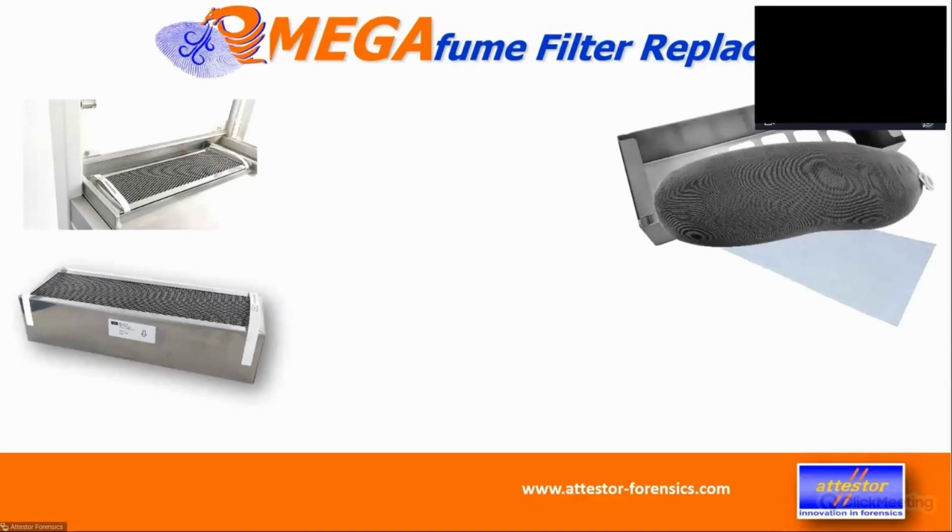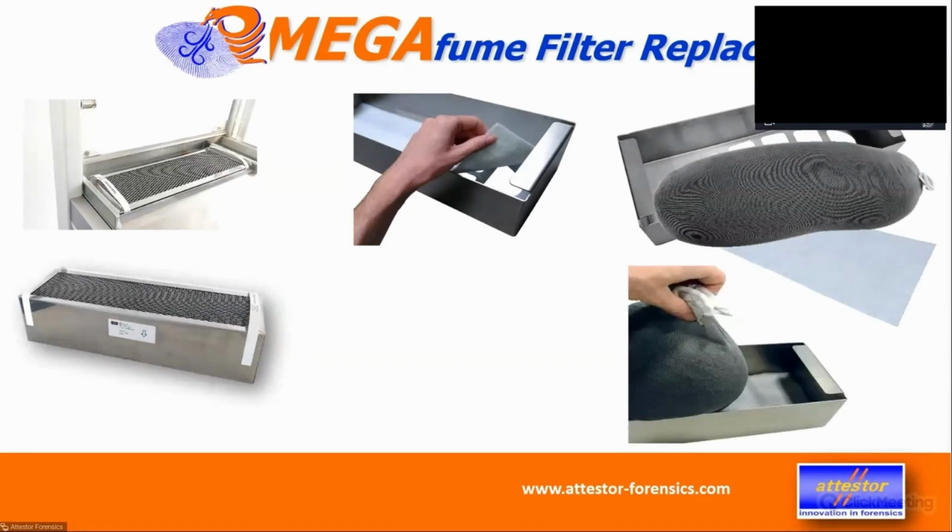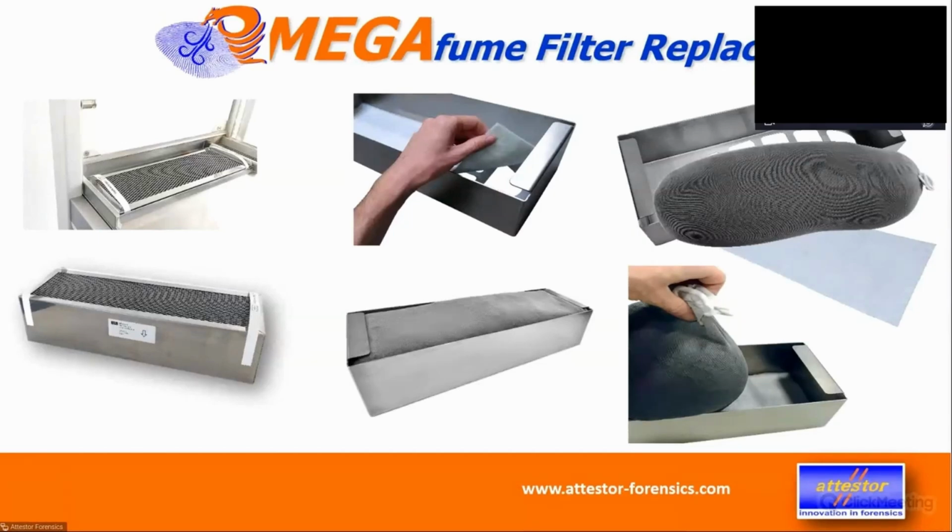Obviously, it could dust a bit, and therefore you have the dust fleece in there. And then when you have to install that, all you do is you place first your dust filter in the bottom of that cage, and then you place your sachet in there, and you have to even it a bit, and in result, that's how the replacement unit then looks like. And you place that one into that slot instead of the filter cassette.